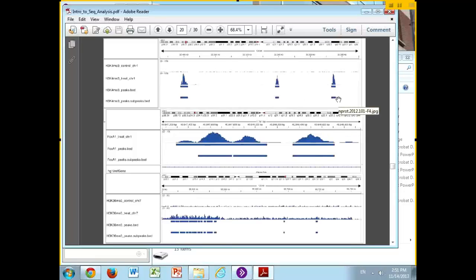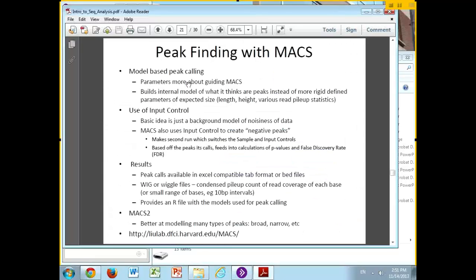These bars underneath each of these is basically a BED file saying this is where I think a peak is. What you're looking at above it is the actual pileup of reads, so you can say it's called a peak here and this definitely looks like a peak to me. That little peak you saw is a WIG or wiggle file. It's basically a count at each base pair of how many of these reads were on top of this base pair, and sometimes somewhat condensed where it just does that in a ten base pair window, makes the file a bit smaller, more manageable. For the really intrepid, if you use the R statistics package, it outputs the models that it had used as an R file, and you can import into R and look at what it thought were peaks.